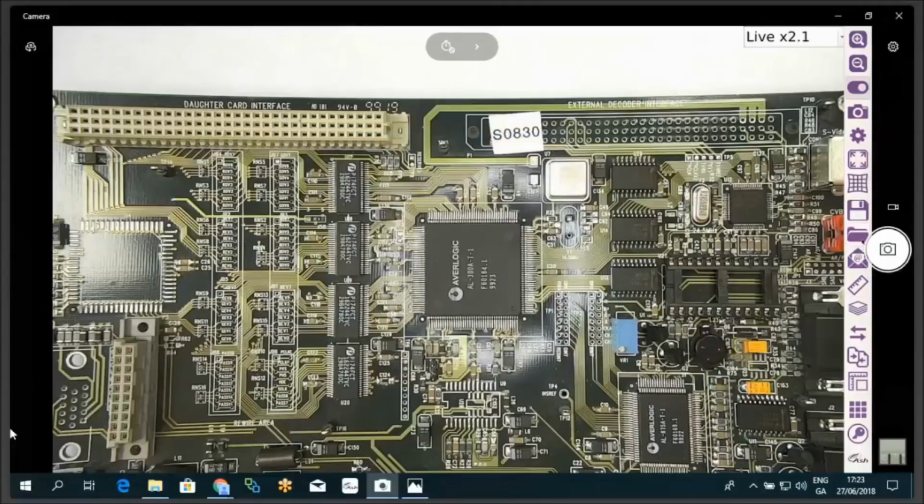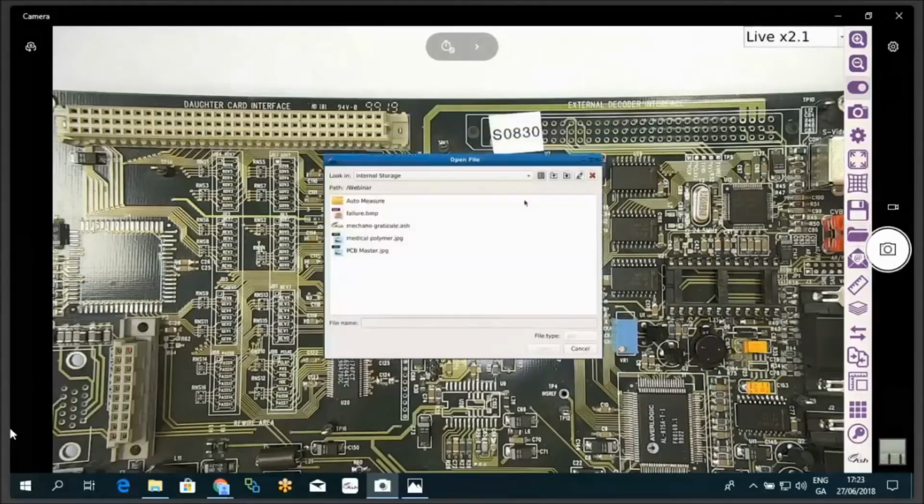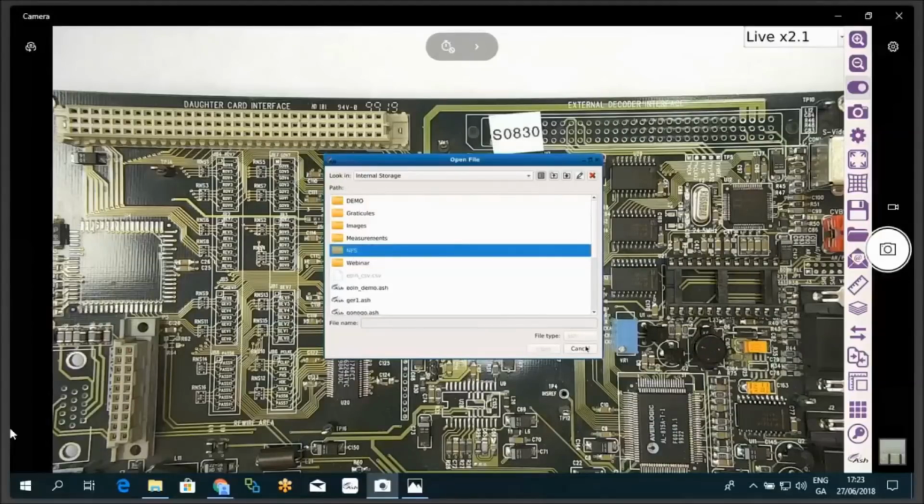You can also store images to a network file location, so NFS. Again, that's a powerful feature. It saves people passing files between different computers or departments. You can save your files to a central location where somebody else then can view them and process them as they require.